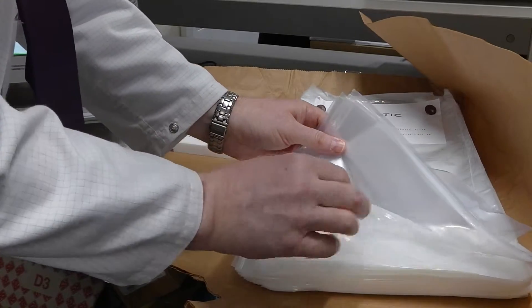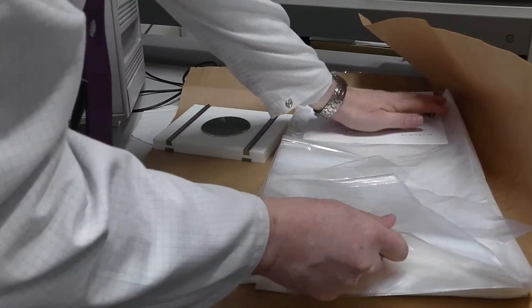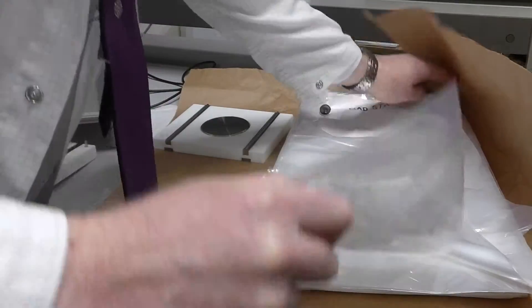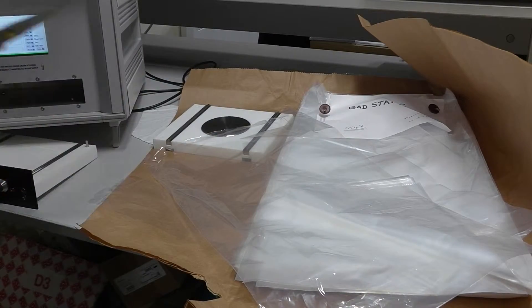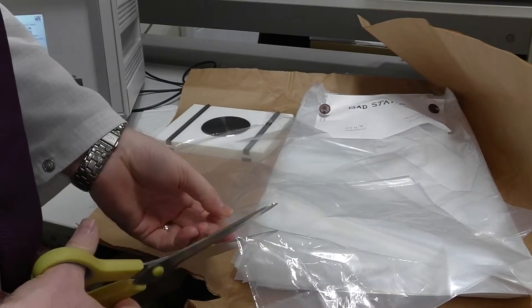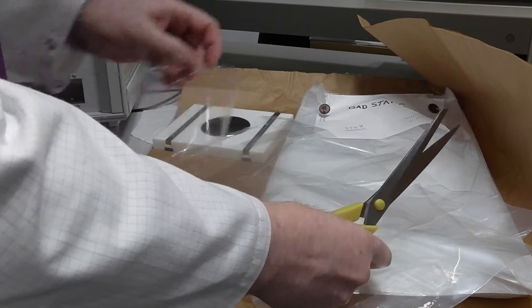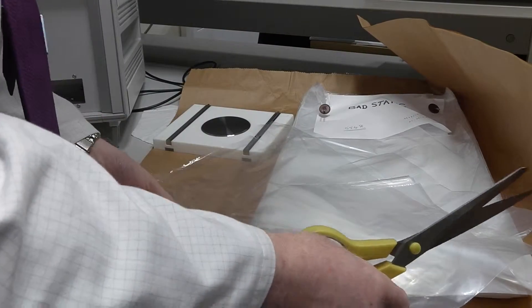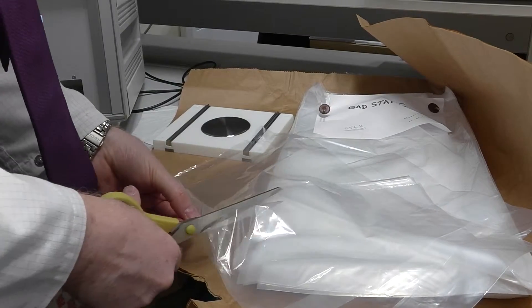We pick a bag from the batch. You can already tell there's quite a bit of static in here. We'll prepare the sample — cut it into size. There's no real science in this; it's going to be roughly 6 by 4.